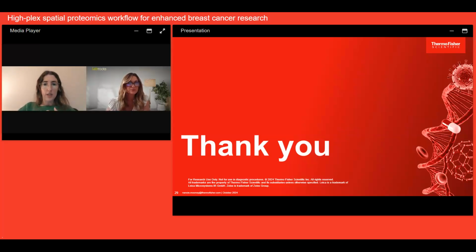For the EVOS S1000, it has a slightly different setup than the traditional filter set. Because it's a spectral imager, it actually takes many more channels than your core channel in order to support that spectral unmixing. So what happens on the EVOS S1000 is when you're feeding in your single color controls, you tell it the names, basically you input what fluors are on your sample. So we'll have all the Aluoras or the Alexas or some of the other standard fluors already built in, and then you give it its spectrum with the single color controls.